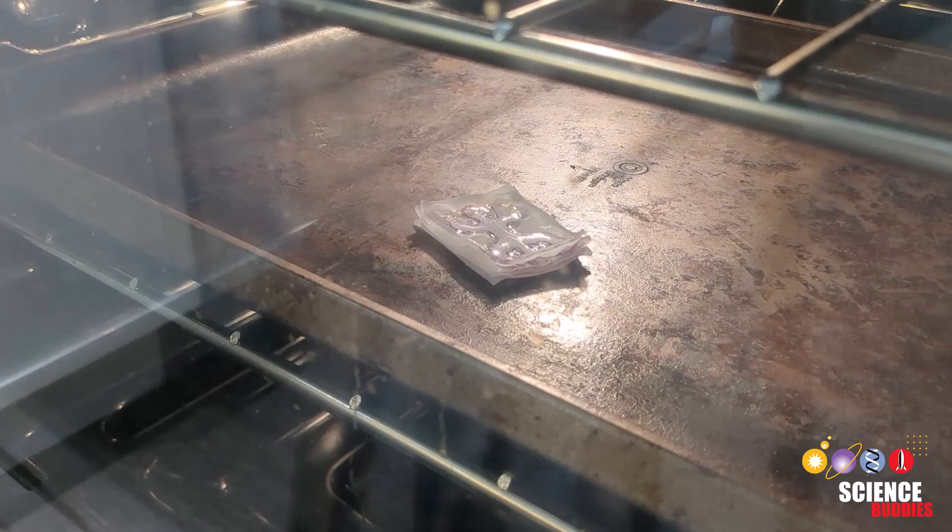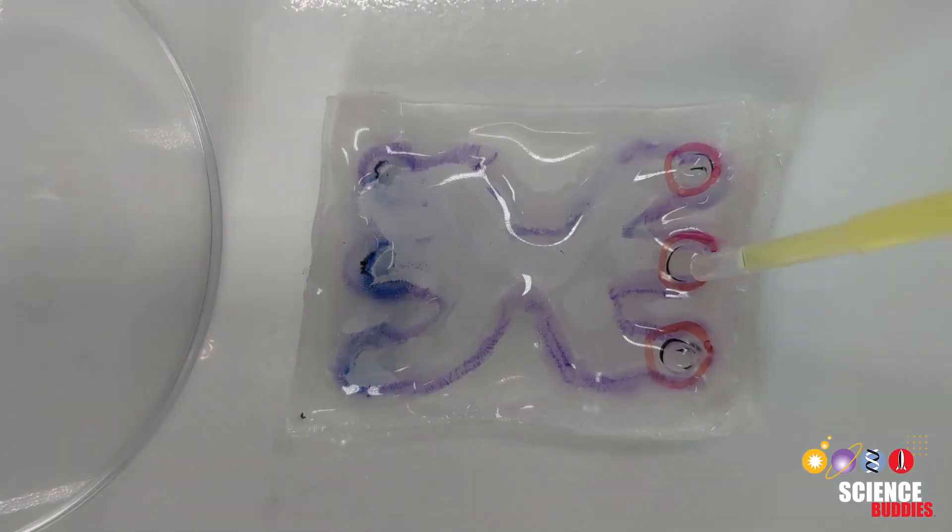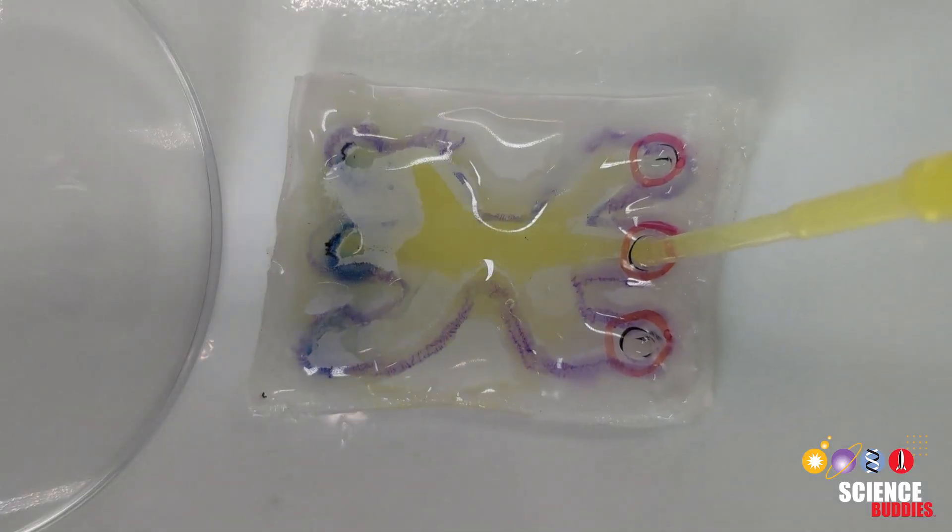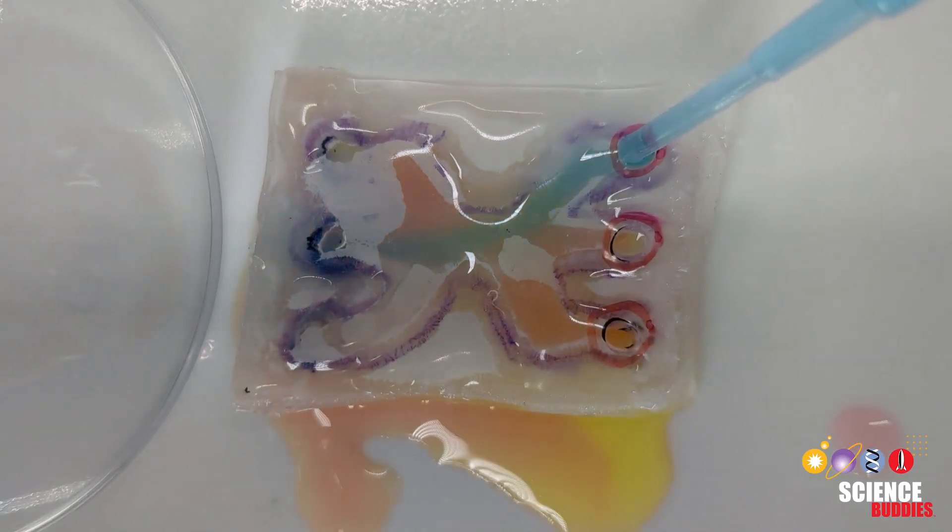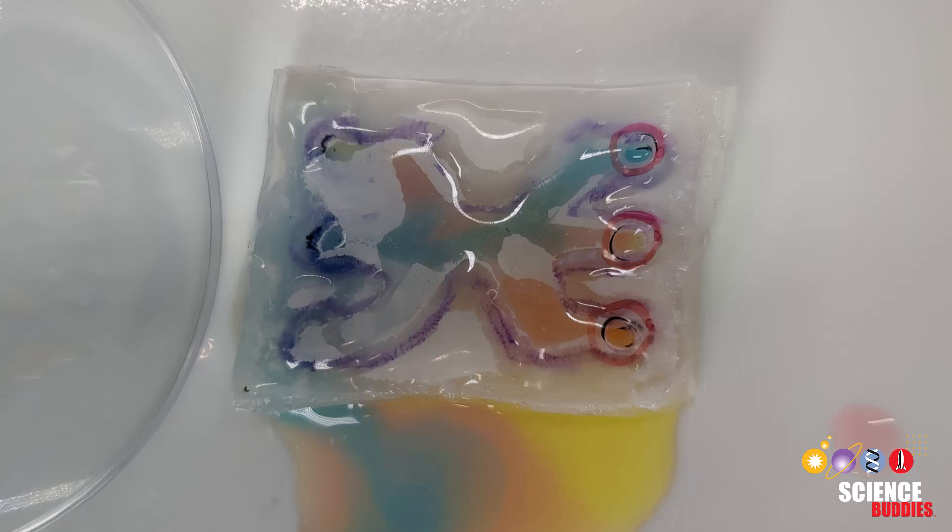How quickly did your microfluidic device shrink? After your device fully cools, you can test if the channels allow fluid through them using diluted dye. You can even use different colors to observe how they mix in the channels.